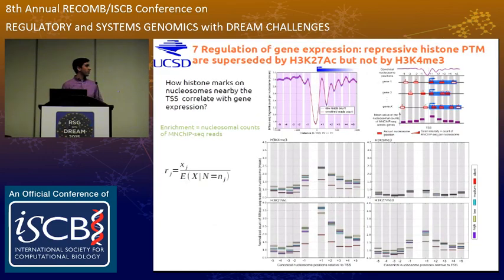So we also look in more detail into the transcription starting site. This time we use the MNase-seq data to call the nucleosome positions of what is called canonical nucleosomes. So here, based on the MNase-seq data, you observe a deep valley. This is expected. The region upstream of the transcription starting site is typically depleted of nucleosomes for the transcriptional machinery to recognize the sequence that are there. And downstream, you have a strong peak. This is called the +1 nucleosome. And based on these peaks, we define from the -5 up to the +5 canonical nucleosome.